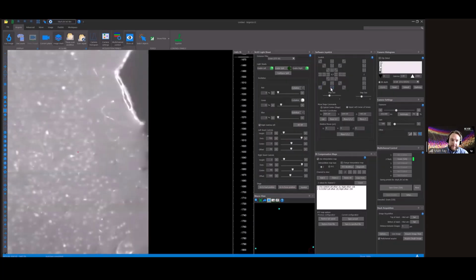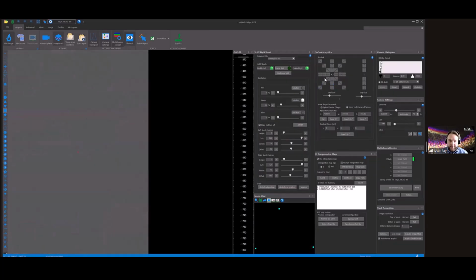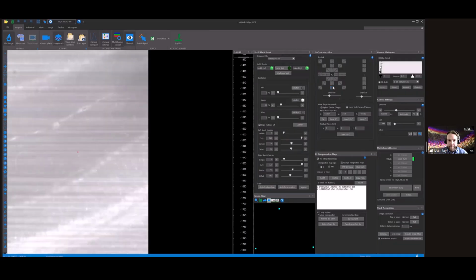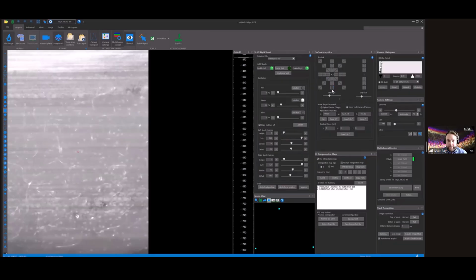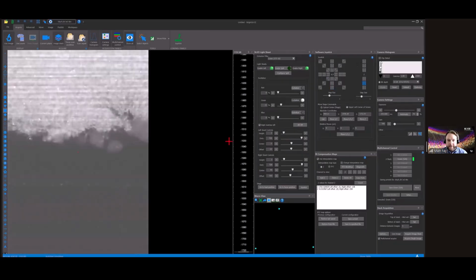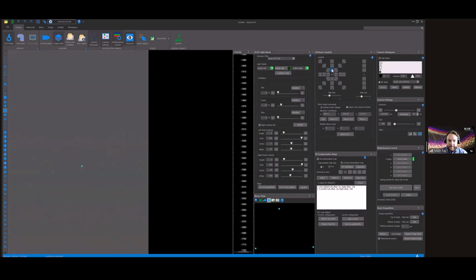You'll notice that as you place these markers in the imaging environment, they will display in our macro view tool. This tool shows you all of the markers in your imaging environment and makes it easy to return to them later. Now that our sample is delineated and looks in focus with our adaptive RI compensation, we'll jump into the tissue scanning workflow.